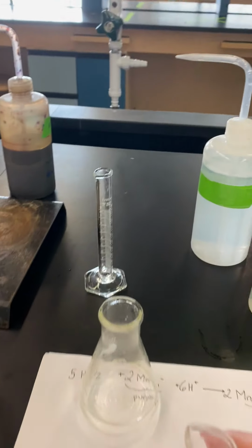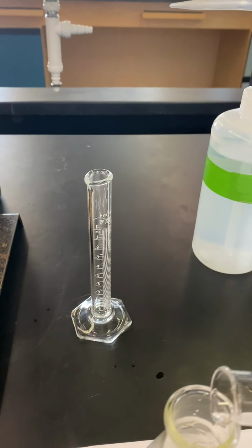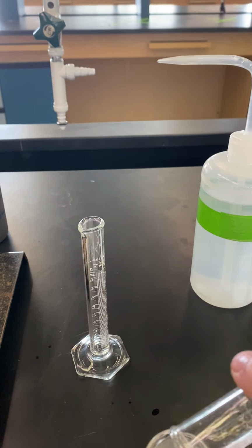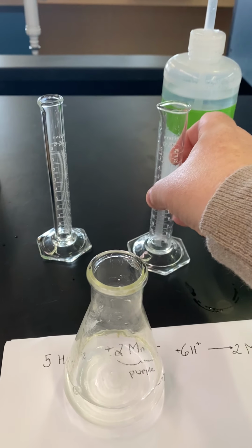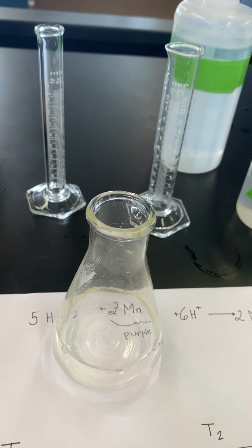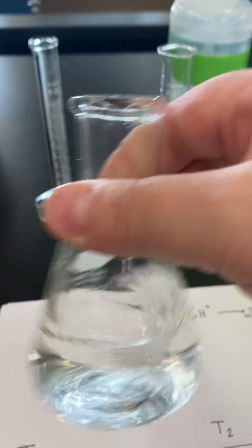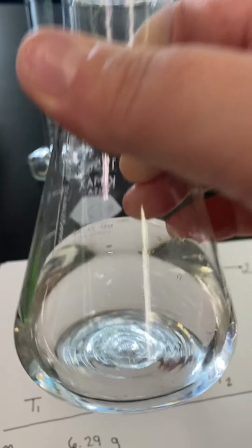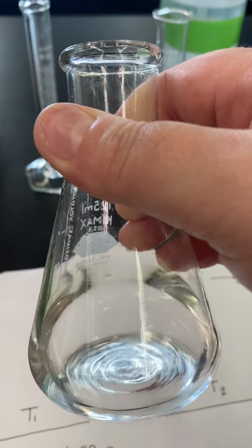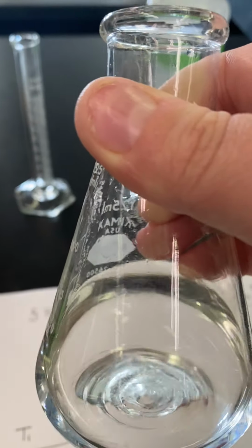Roughly at 15 milliliters with the meniscus. So again, I'm going to dump that 15 milliliters right into my Erlenmeyer flask that contained the hydrogen peroxide and the water. Okay, so my reaction flask now contains 6 grams of my hydrogen peroxide solution, 25 milliliters of deionized water, and 15 milliliters of the sulfuric acid solution. This is ready to start the titration.